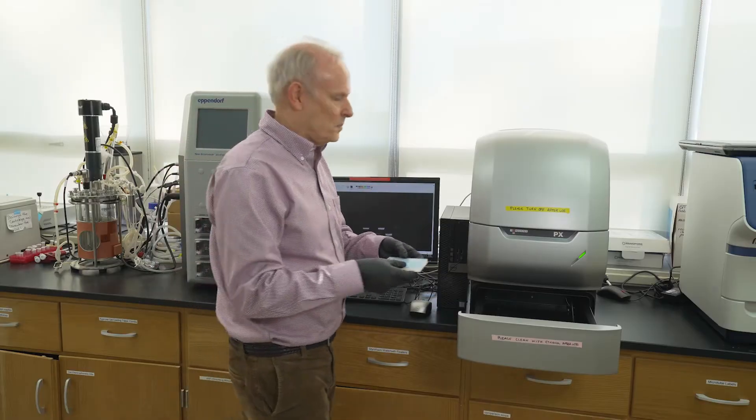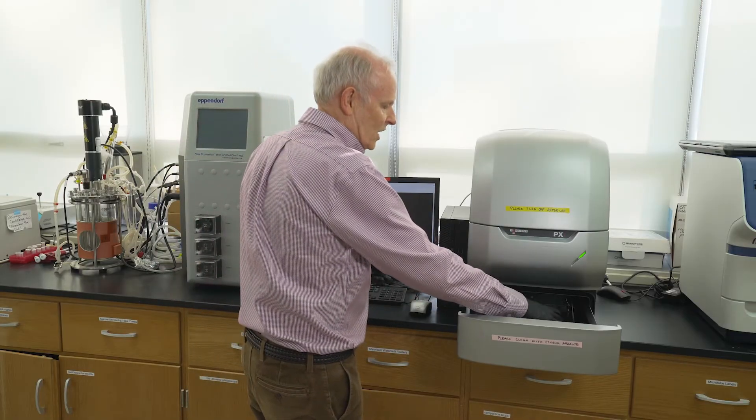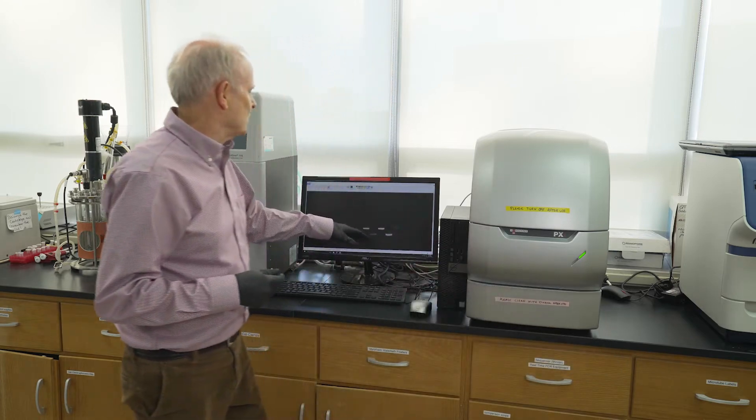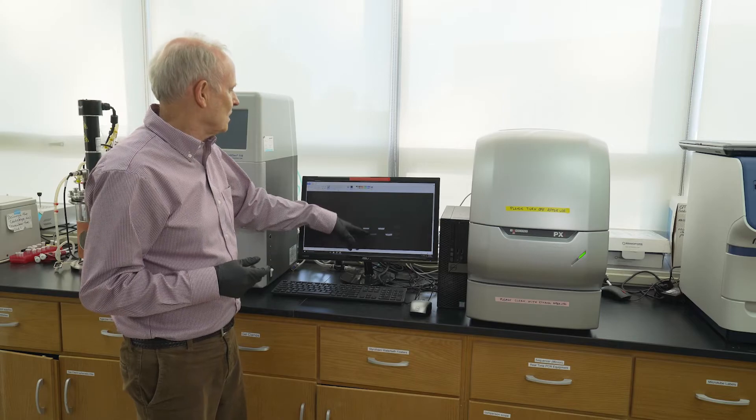Here I have the gel that's been run. I can put it in a gel visualizer, shut this drawer, and it will visualize what's on the gel using UV light.